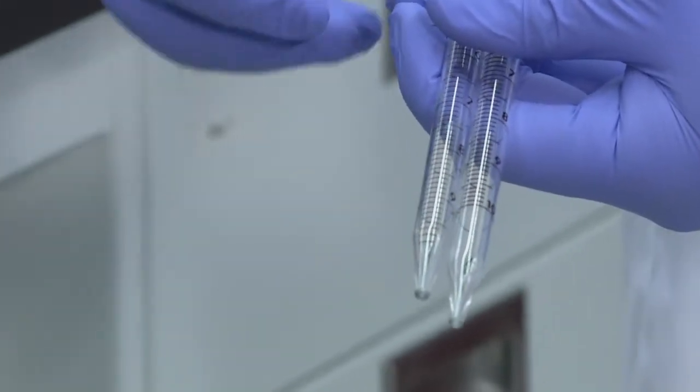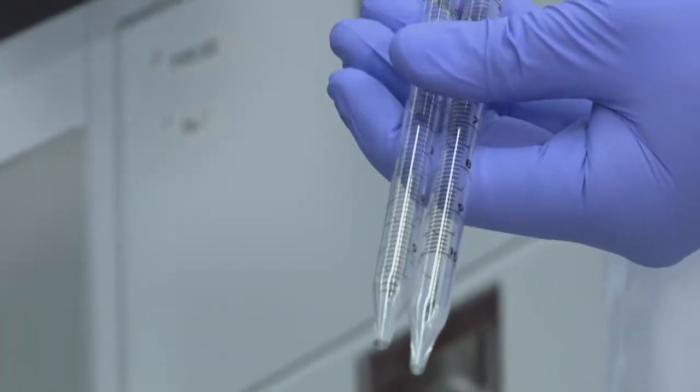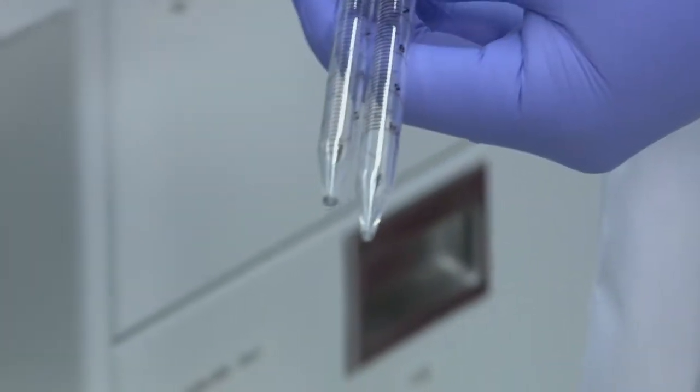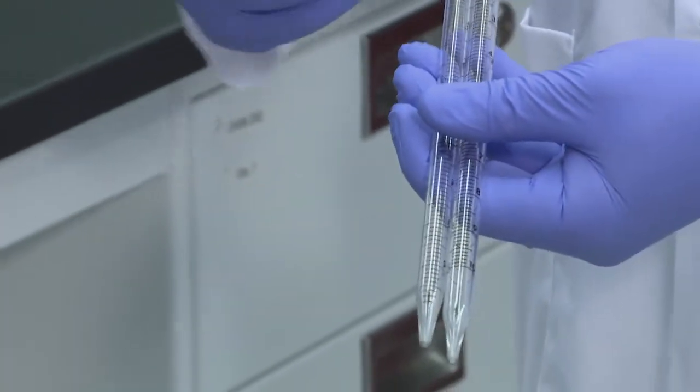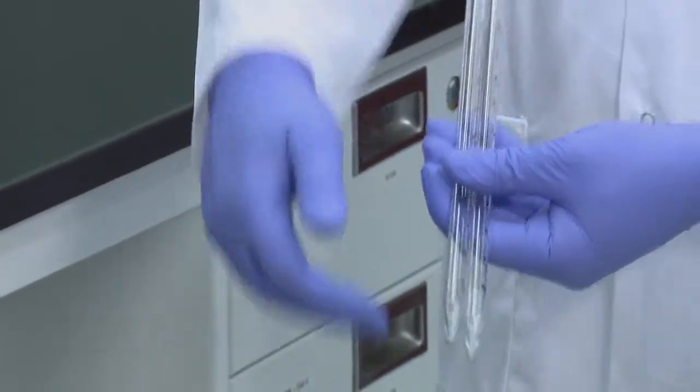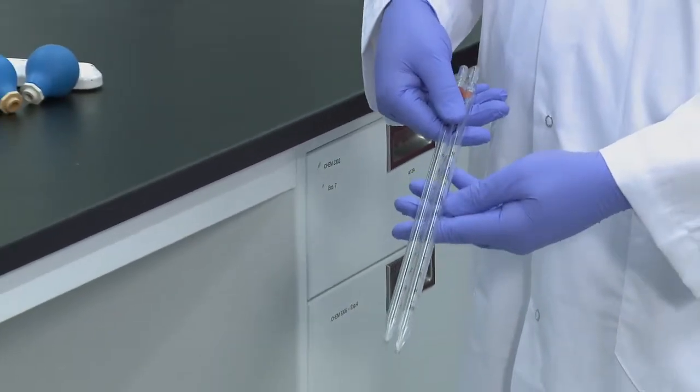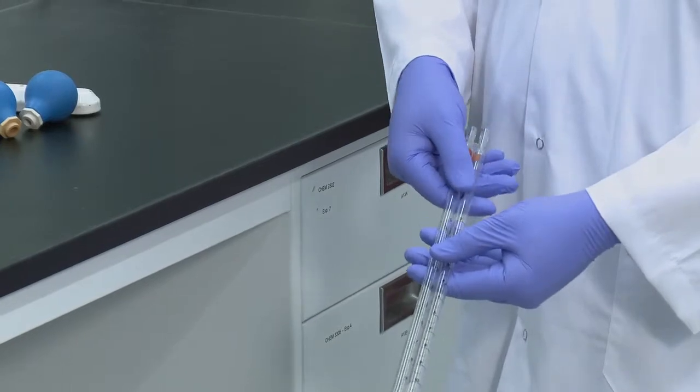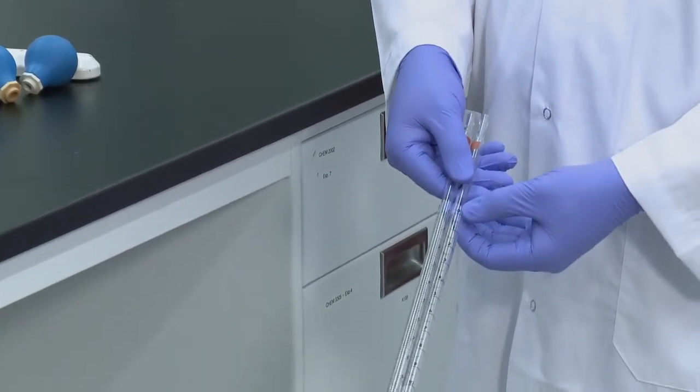On the right we have the serological or blowout pipette where the gradations go all the way to the bottom. This pipette is intended to be emptied from whatever line you're at to the very bottom. On the left we have a Mohr pipette where the bottom part is uncalibrated. So to deliver 10 mL in this pipette you would go from the zero line and stop at the 10.